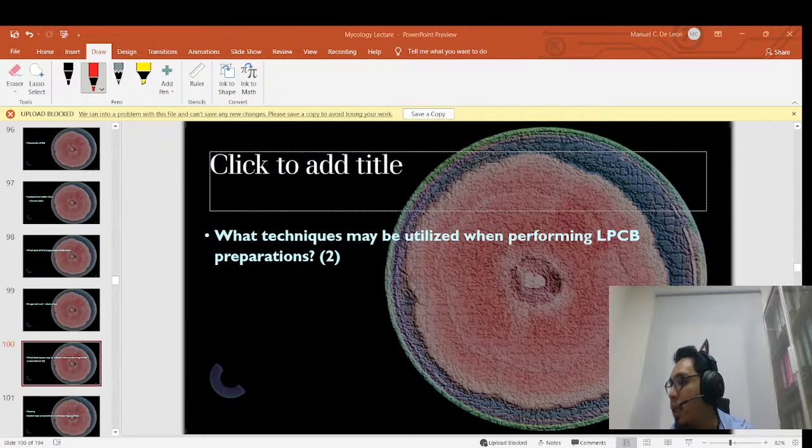What you do is you get a slide. I only have this culture media. If you're looking at it in YouTube, all right, YouTube people, I'm not wearing gloves because this is a sterile one. So I have an agar plate with me, care of my current hospital. Thank you so much. I'm not promoting them because this is a government institution. So what happens is you put a piece of tape on an inoculating loop or whatever you want to use to touch the sample, and then put it on the slide with lactophenol cotton blue.